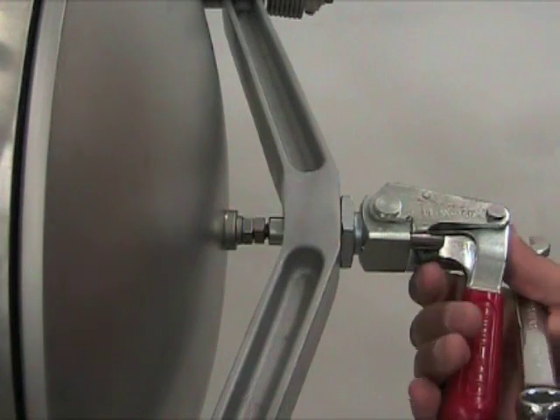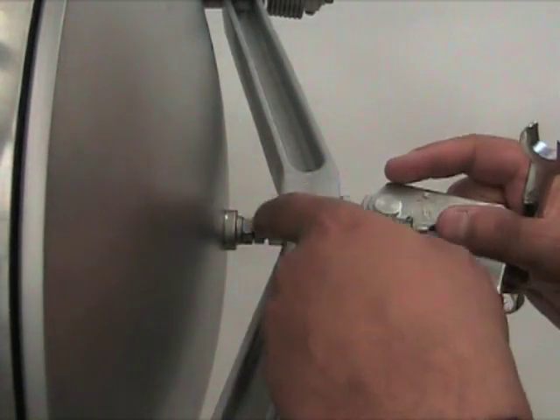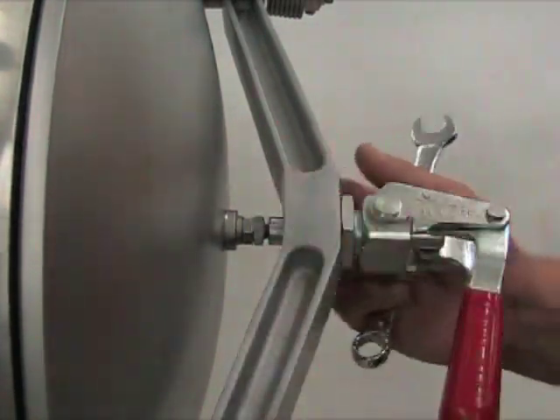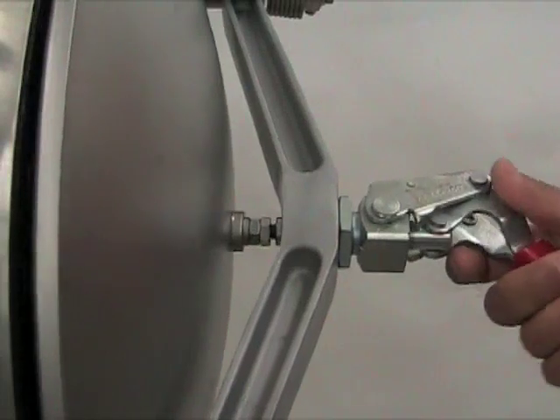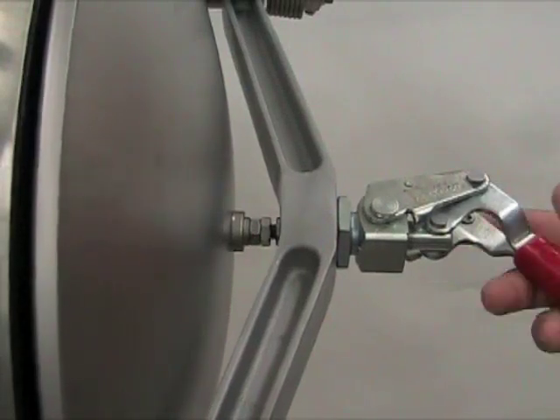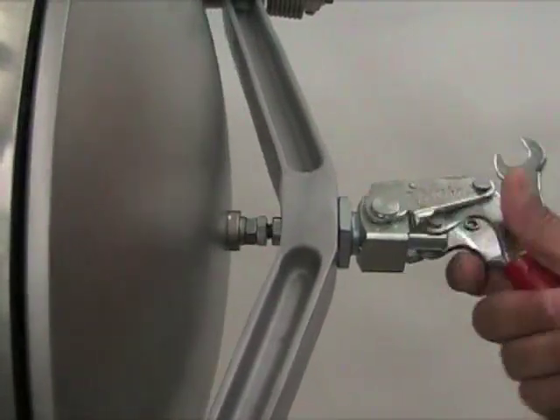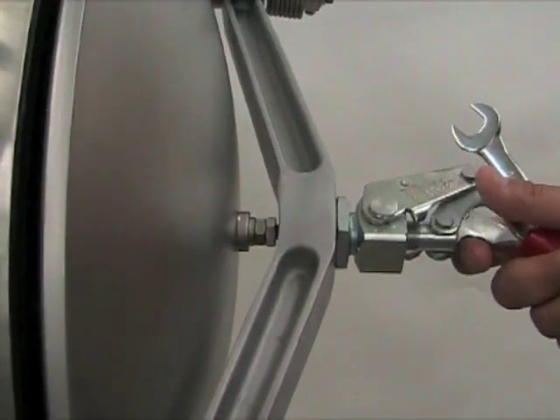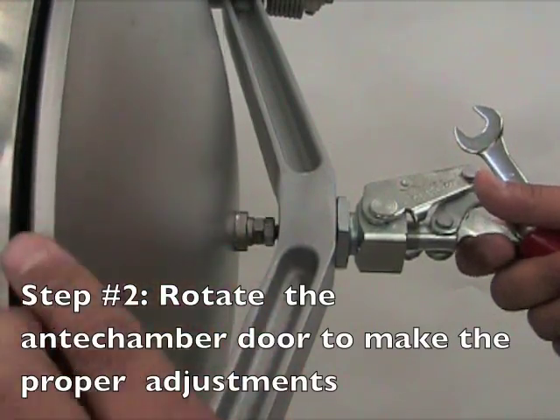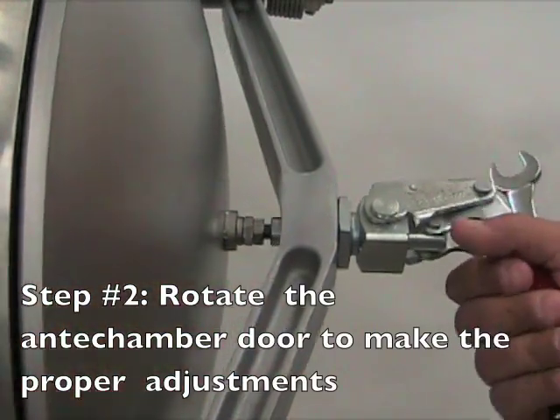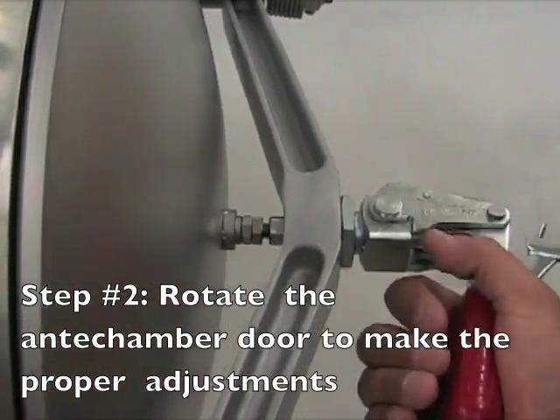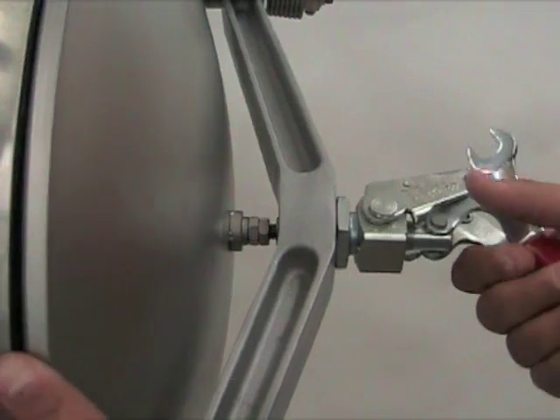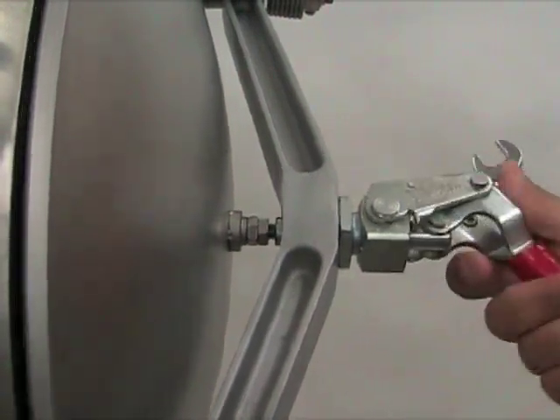So now that we've loosened the jamming nut, what you want to do to increase the closing tension is turn the anti-chamber door clockwise. And that feels about right.